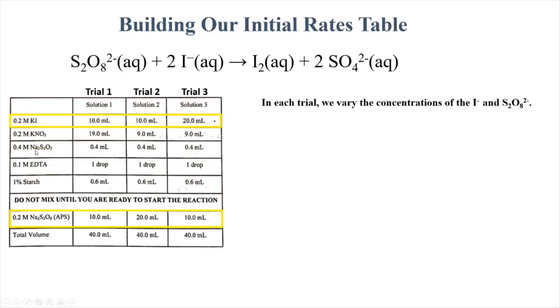Another thing we could ask you is, what would happen if instead of using 0.4 mL of the Na2S2O3, we used 0.8 mL of the Na2S2O3? You should know what each one of these things is doing and how it affects the clock reaction. So what would that do to the time it would take to get to the blue adduct?